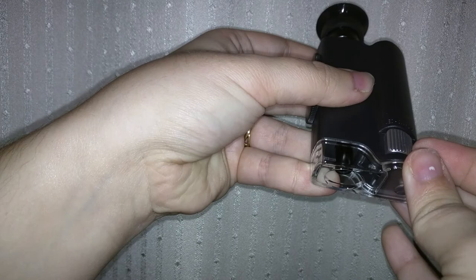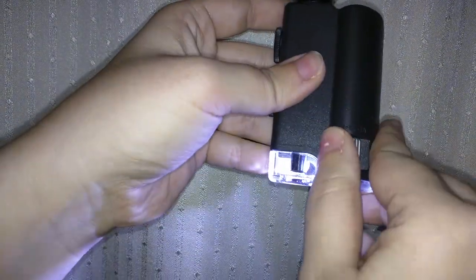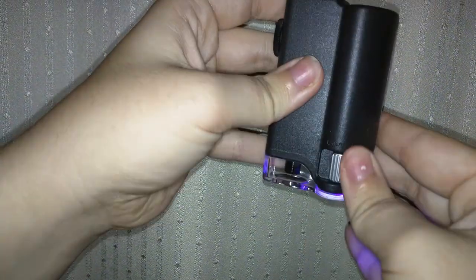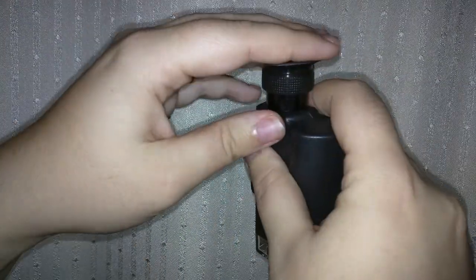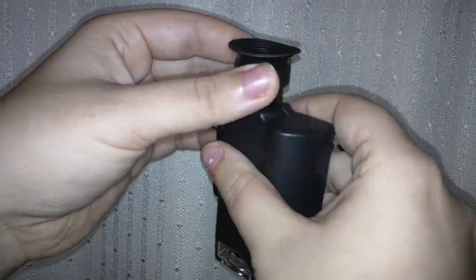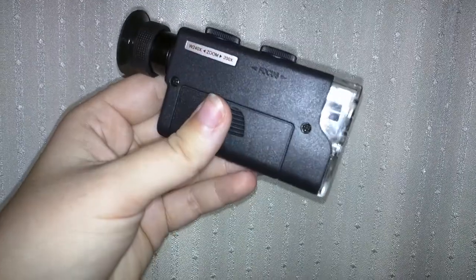So LED, you can see it's coming from here, and UV. I thought it was pretty cool that it had both, and it actually works pretty well. This part right here is flexible, so it conforms to the eye. It makes a nice little seal. But I just wanted to show you, that is how this little pocket microscope looks.